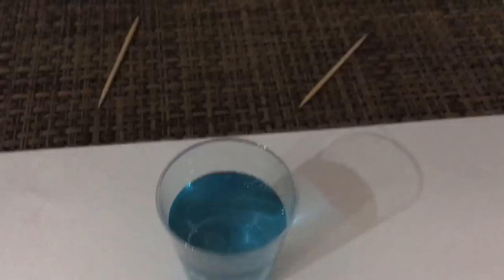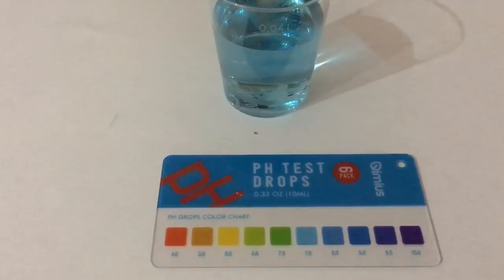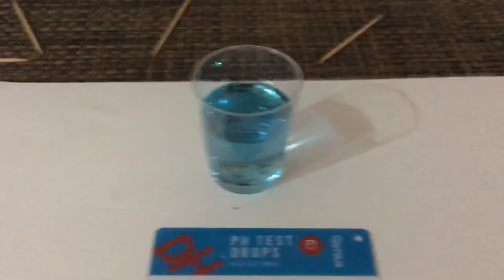Let's go to this one — here we go — this is Monquelle, the most expensive water here when you buy it at the store. And I would say this one is also a good 7.6 according to the scale.